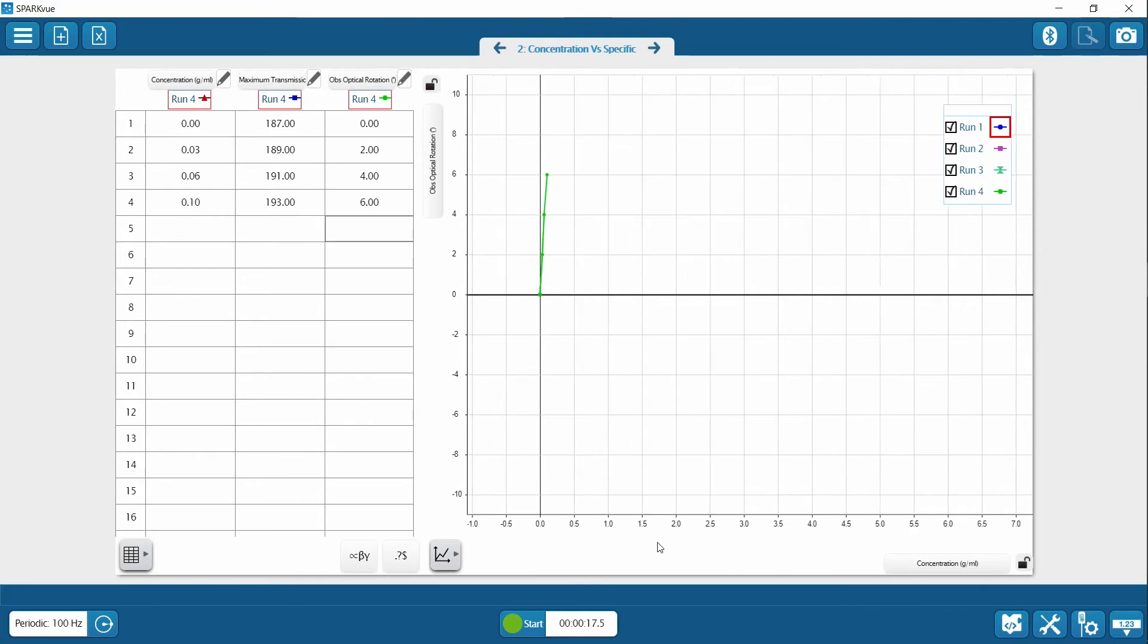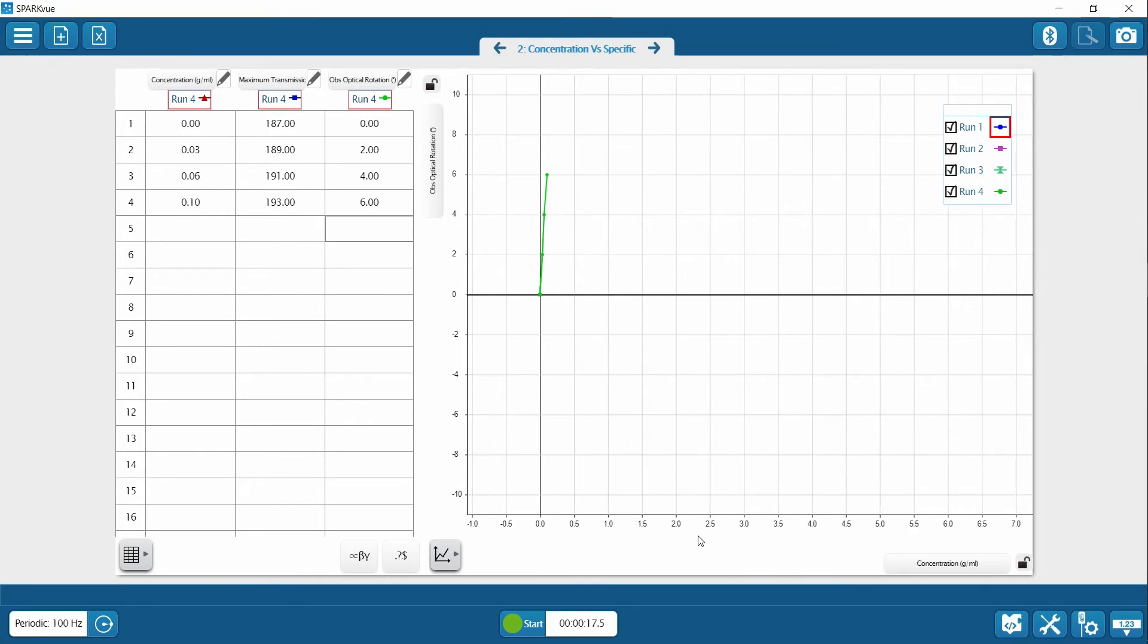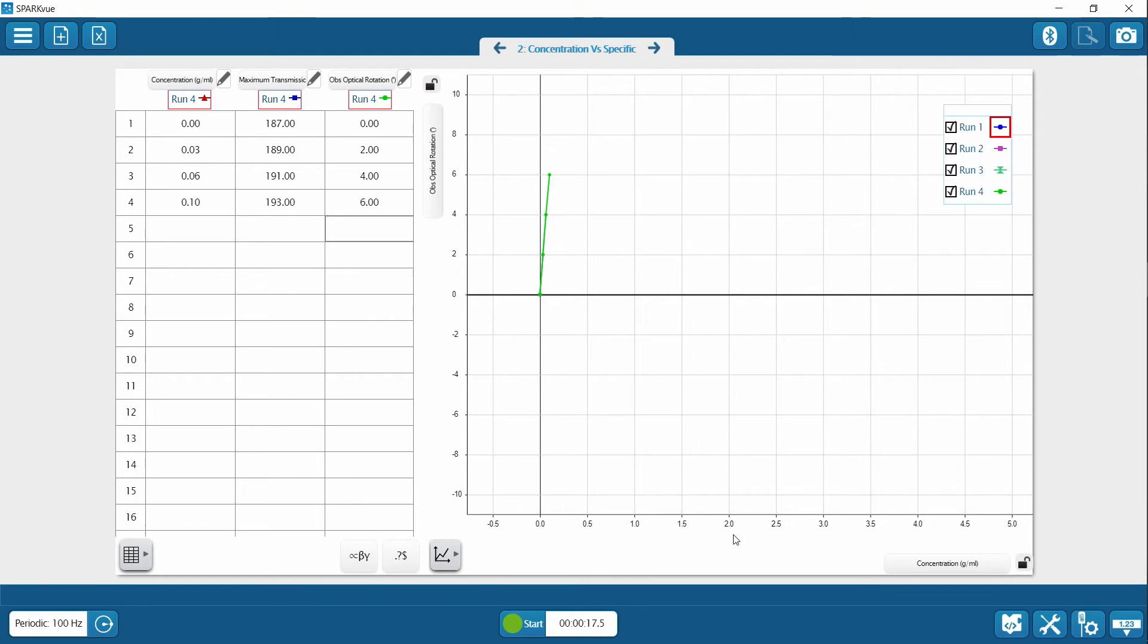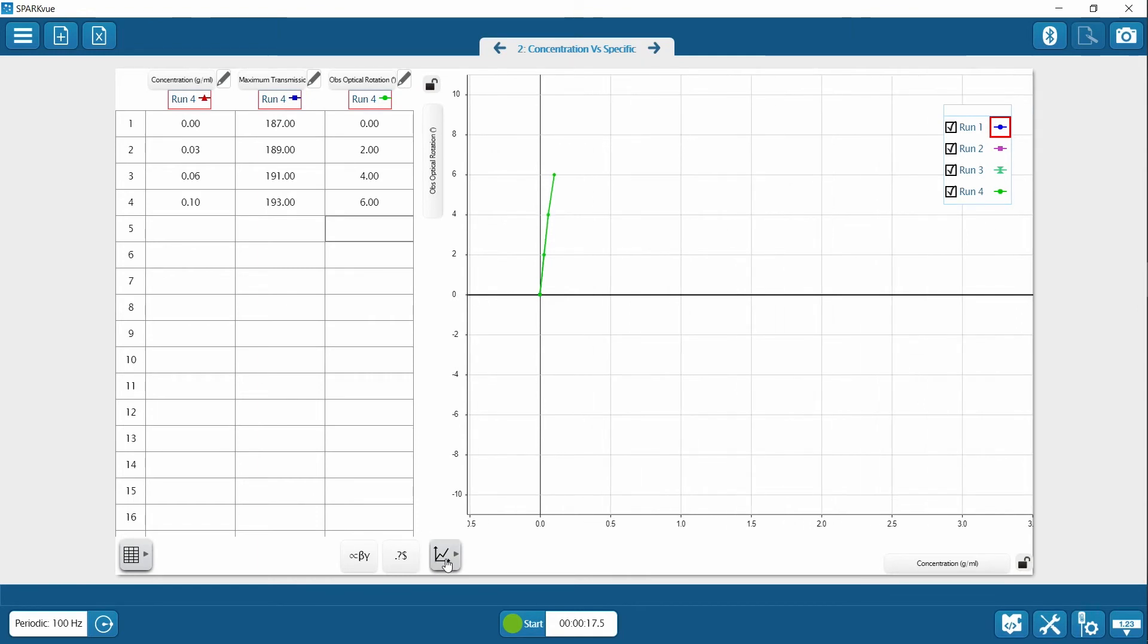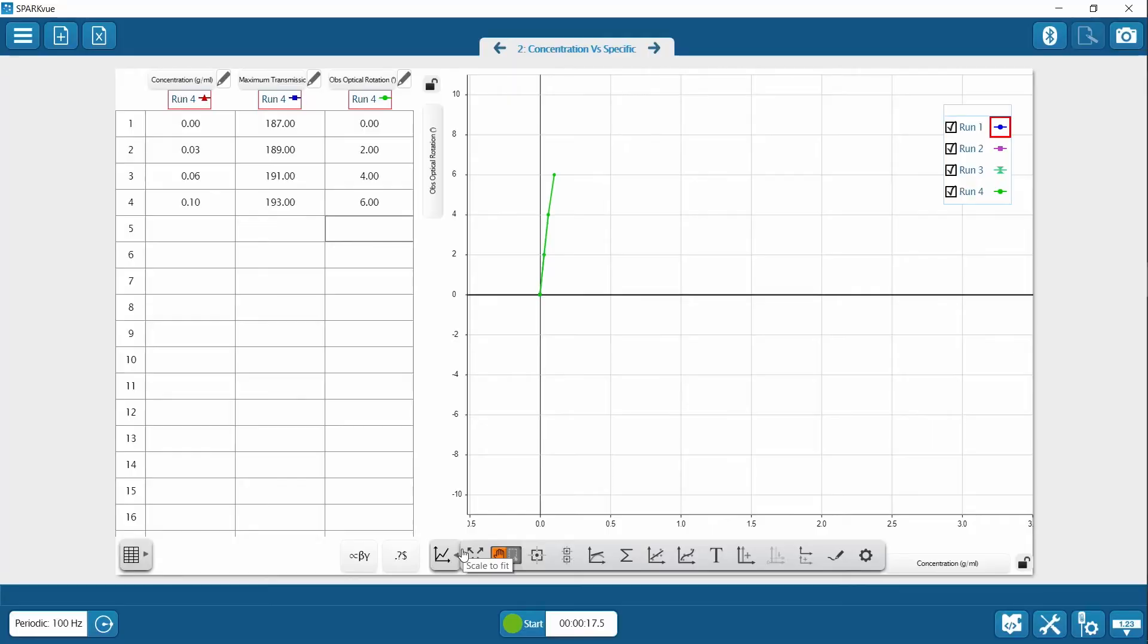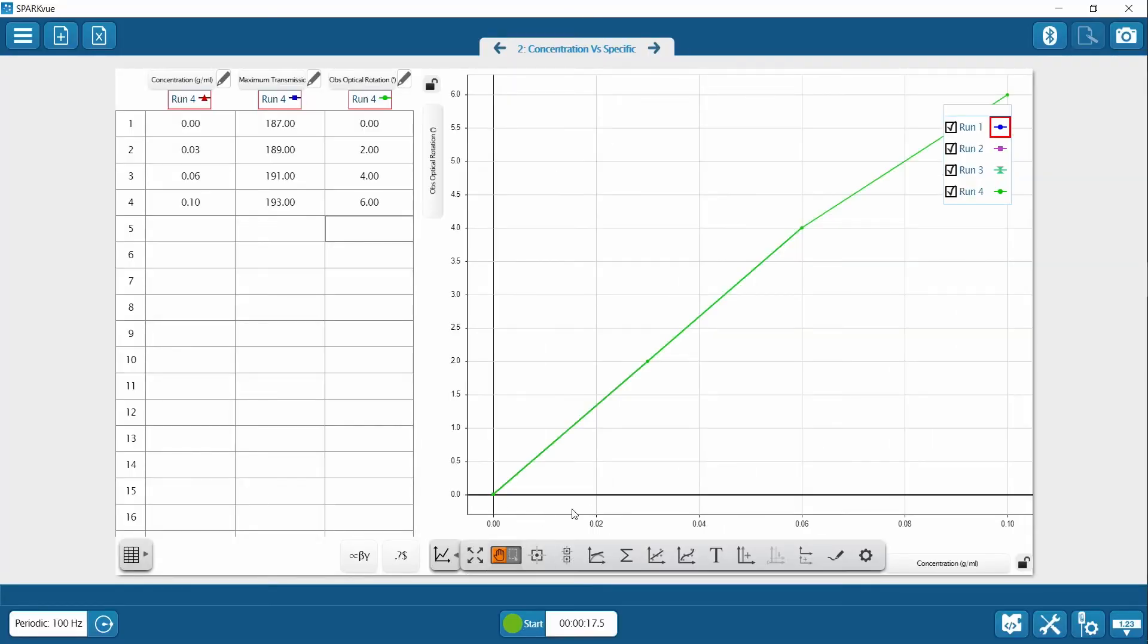What's nice is you can change the scale of this by pulling on the axes. That's one way you can get this to fill your screen, or you can just use the tools in the bottom and then hit the arrows so that it zooms to your data. Notice it'll move the graph too, so your data is showing up.